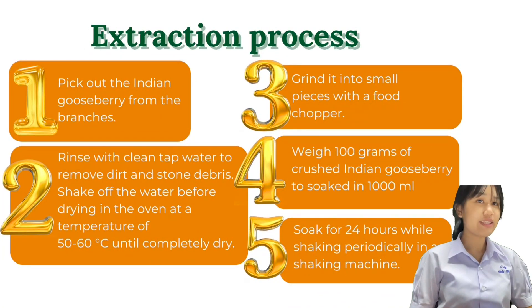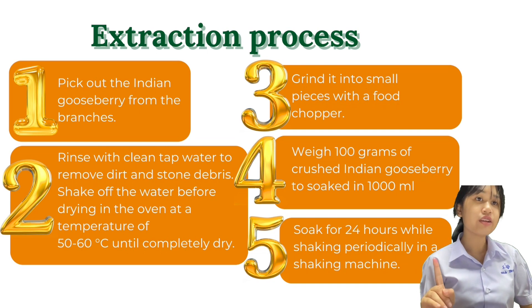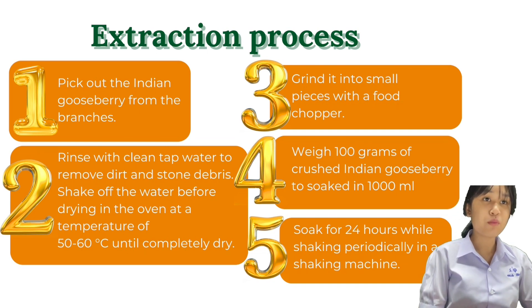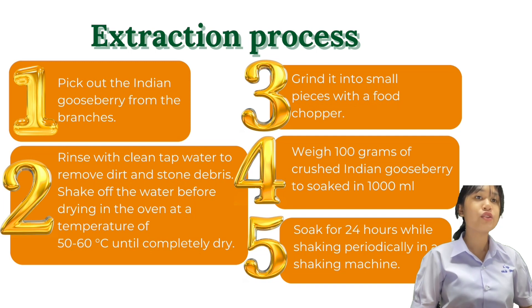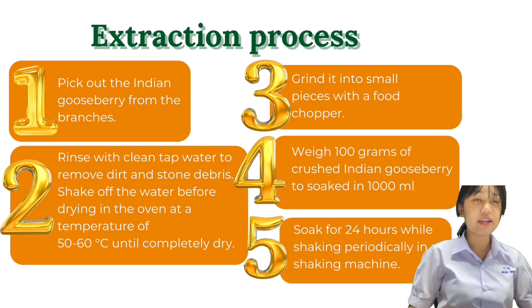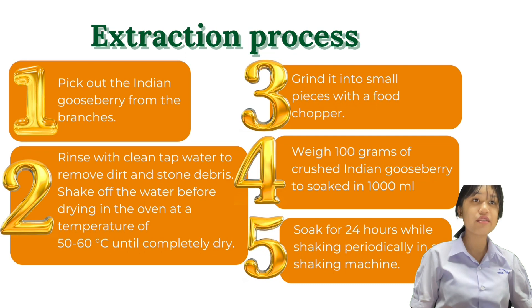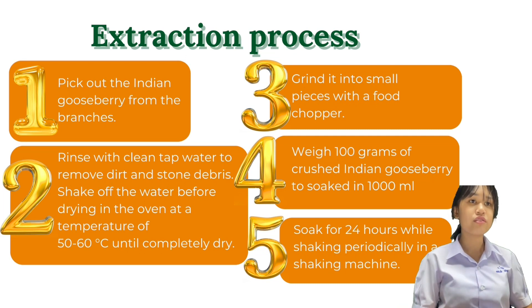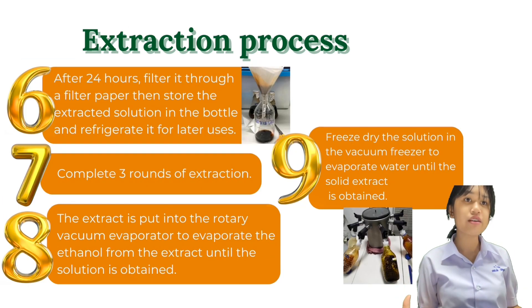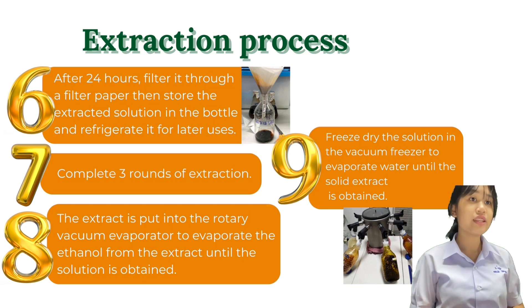To make the effervescent mouthwash tablet, we extracted the Indian gooseberry and Thai basil extracts. Pick out the Indian gooseberry from the branches. Rinse with clean water to remove dirt. Shake off the water before drying in the oven at 50 to 60 degrees Celsius. Grind into small pieces with a food chopper. Weigh 100 grams of crushed Indian gooseberry and soak in 1,000 ml. Soak for 24 hours while shaking periodically in a shaking machine. After 24 hours, filter it through filter paper. Store the extracted solution in a bottle and refrigerate for later use.